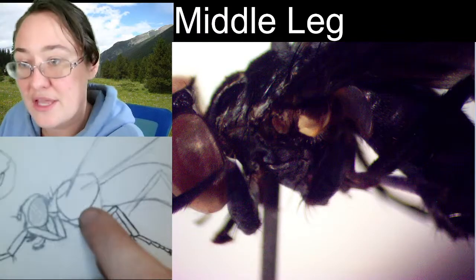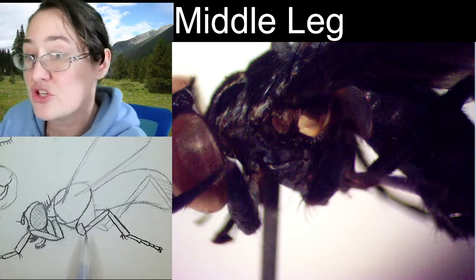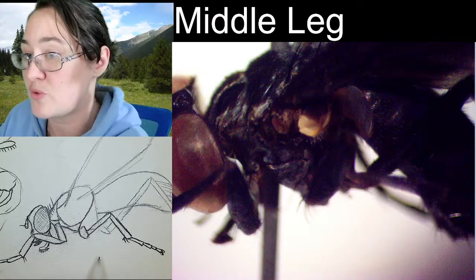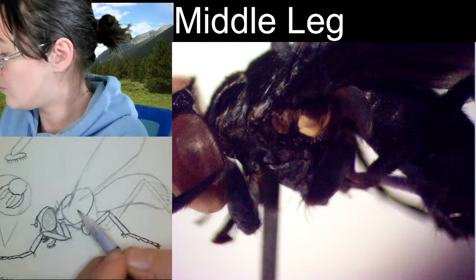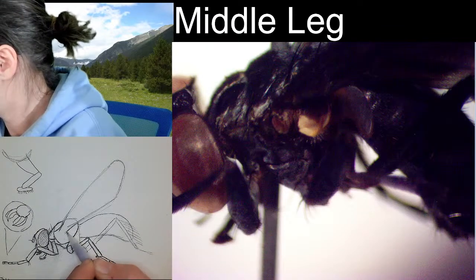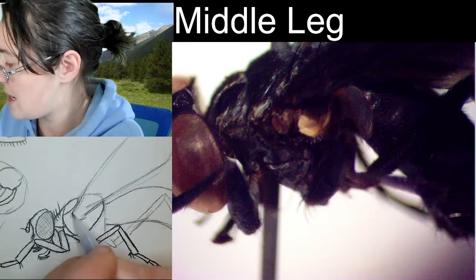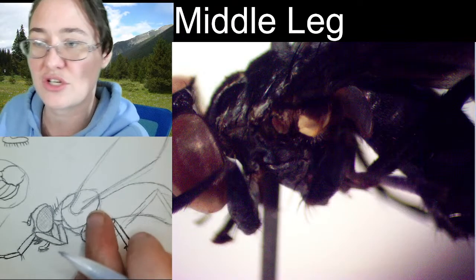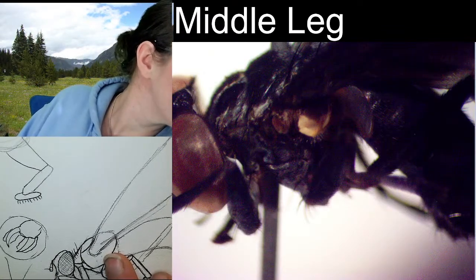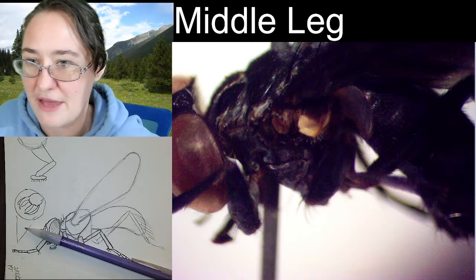Alright, so it appears that you've got suture. The sutures would be the division in between the sclerites, right? So you have one suture that's coming up in this direction, one suture that comes down from this triangle and hits this one, and then your wings are actually going to be kind of right smack dab in the middle of this. So if you imagine this is our wing here coming off of the fly, then we're going to have some additional characteristics back here, like the calyptor. Let's see if I can get a little bit better lighting on the calyptor.